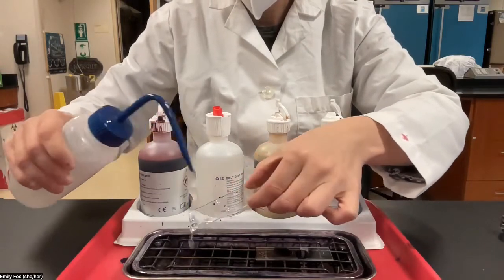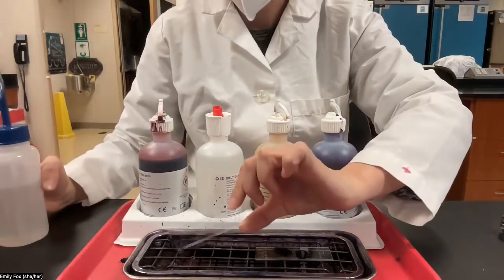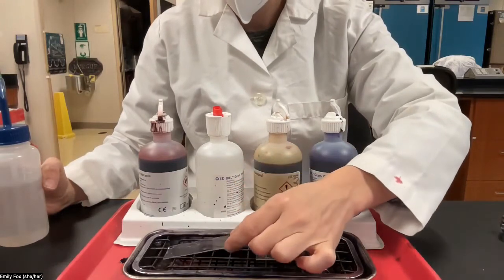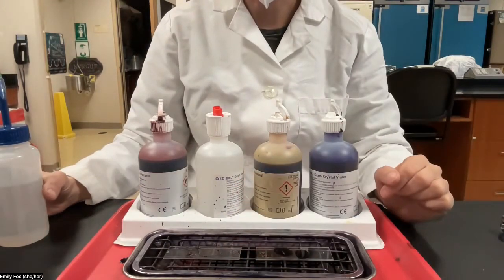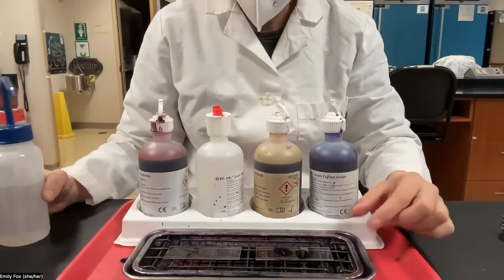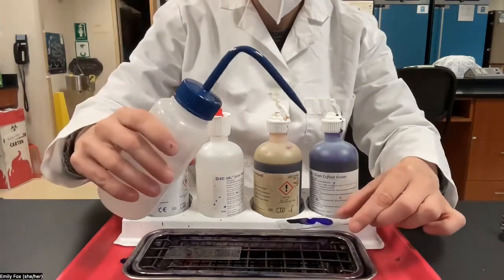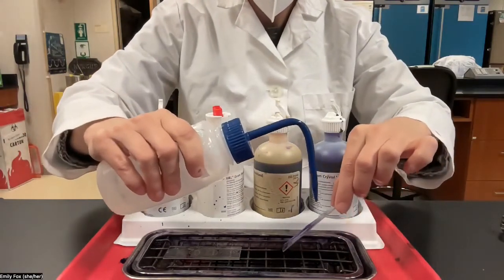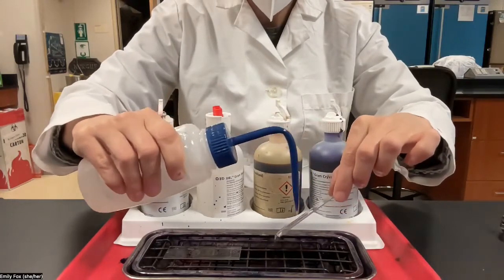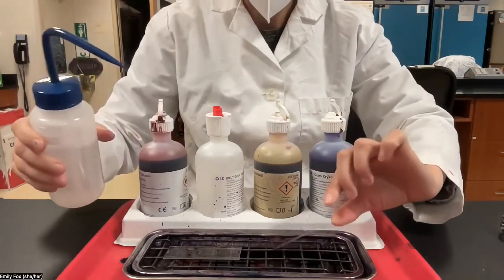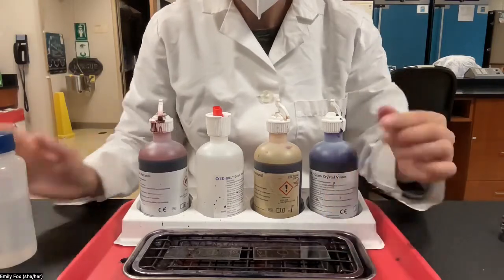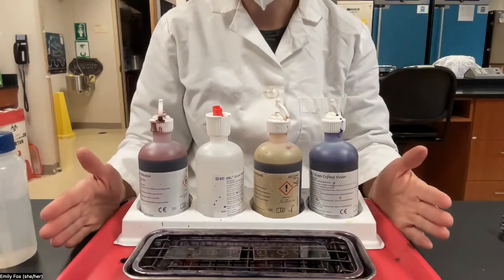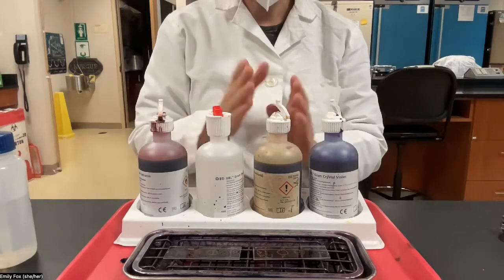Just rinse with water until it runs clear, and then you can tap it on the staining tray and lay it down gently. Let's rinse the other one. We don't need to dry in between our wash steps.